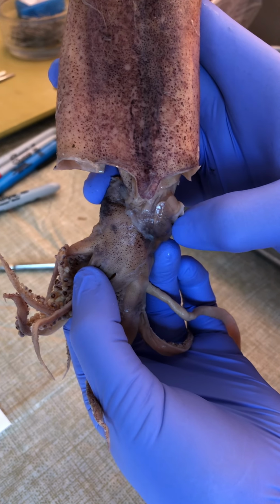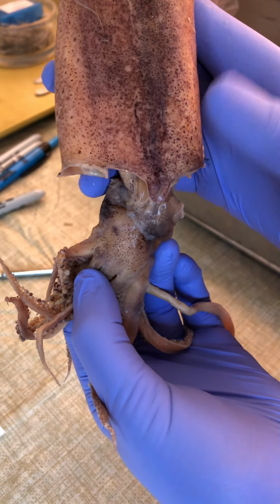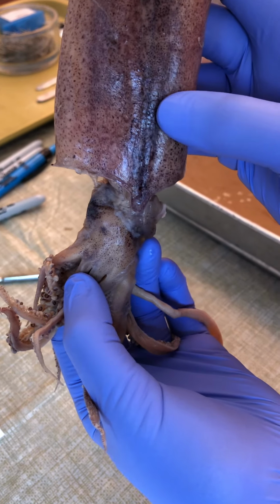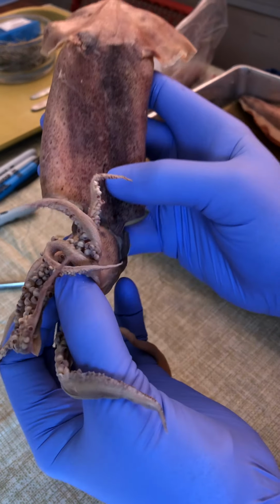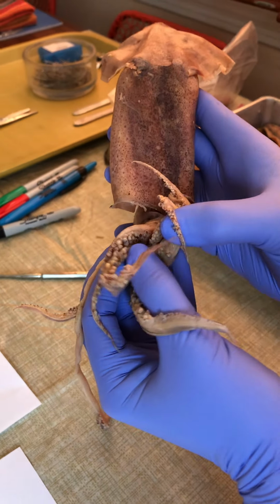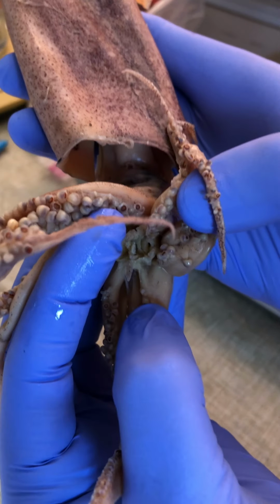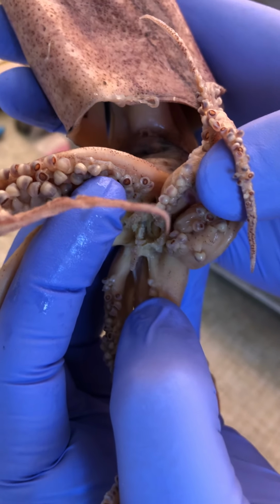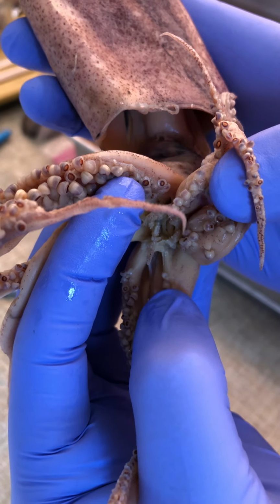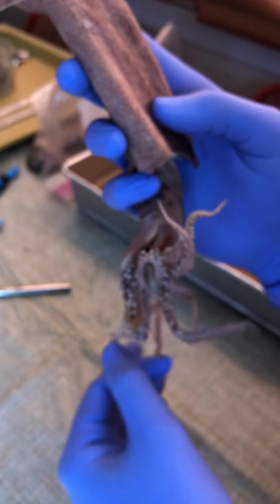And the eyes are really just like our eyes, although they're not homologous, but they have lenses, a cornea, kind of a retina-like structure. Now if we look right on full-on ventral surface, there's the mouth at the base of these arms. So we have 8 arms. Okay, 4 on each side.